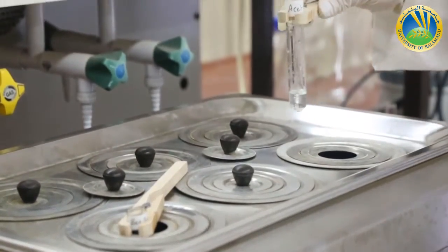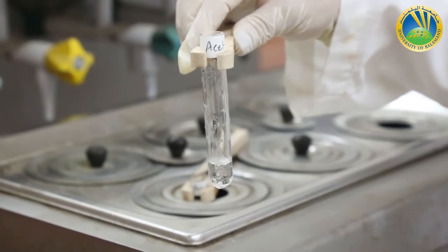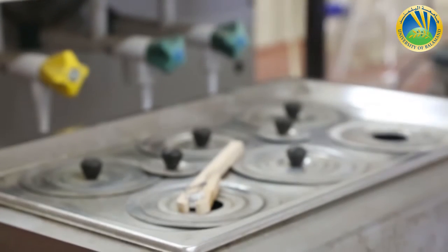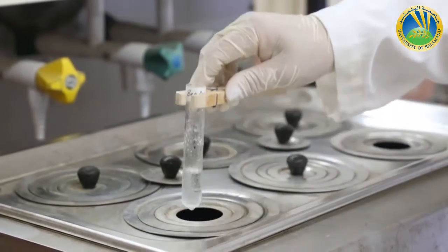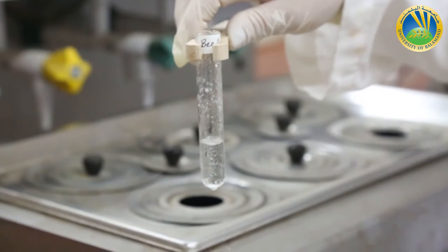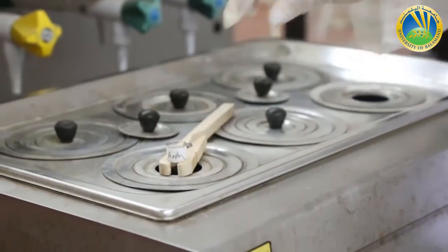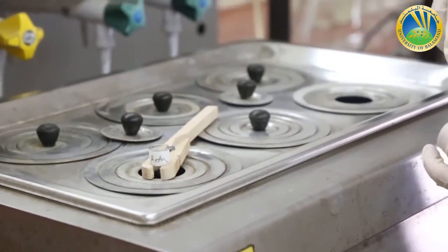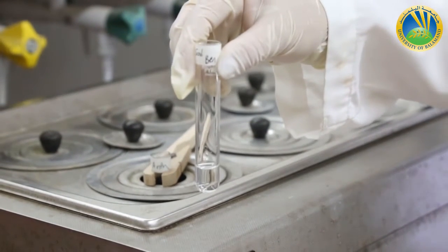Now, as you will see, acetanilide has totally dissolved inside hot water. Now I will check benzoic acid. Also, benzoic acid has totally dissolved in hot water. Now I will check anthracene inside the boiling water. And as we saw that sodium benzoate has totally dissolved at cold, there is no need to test it at hot.